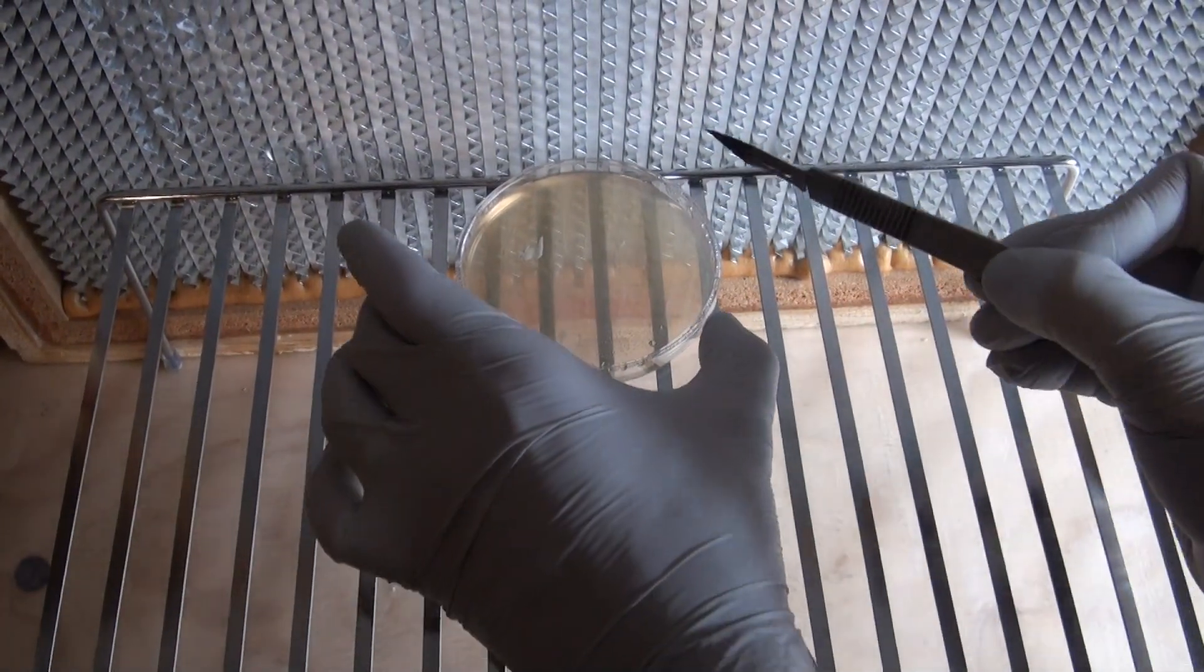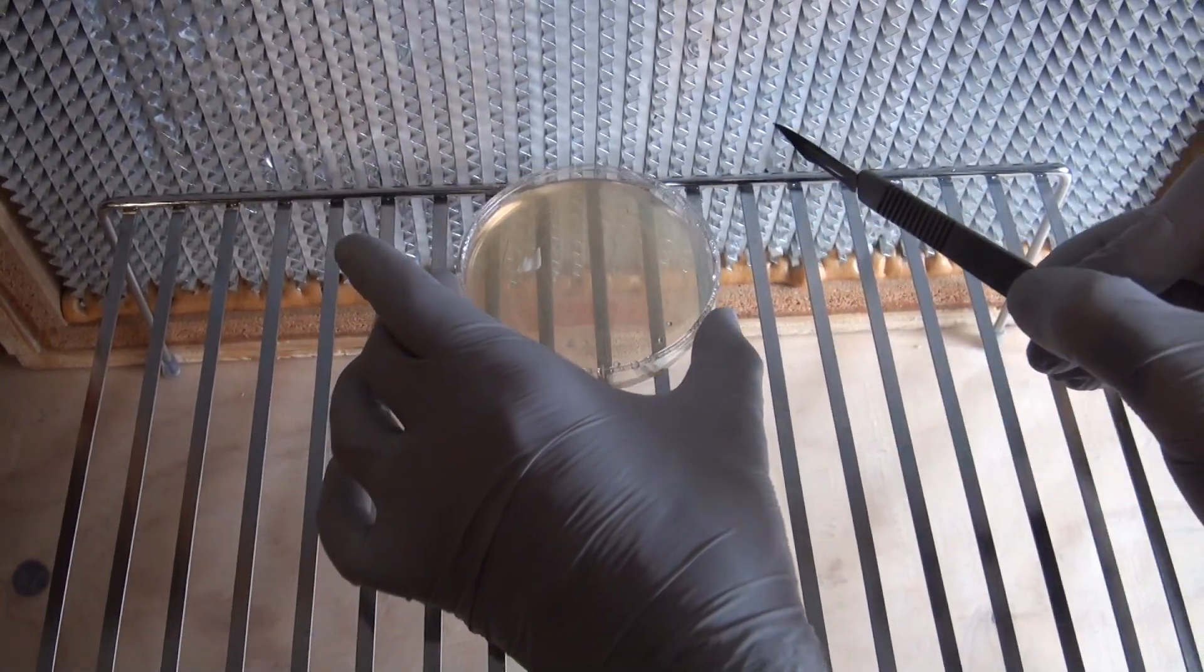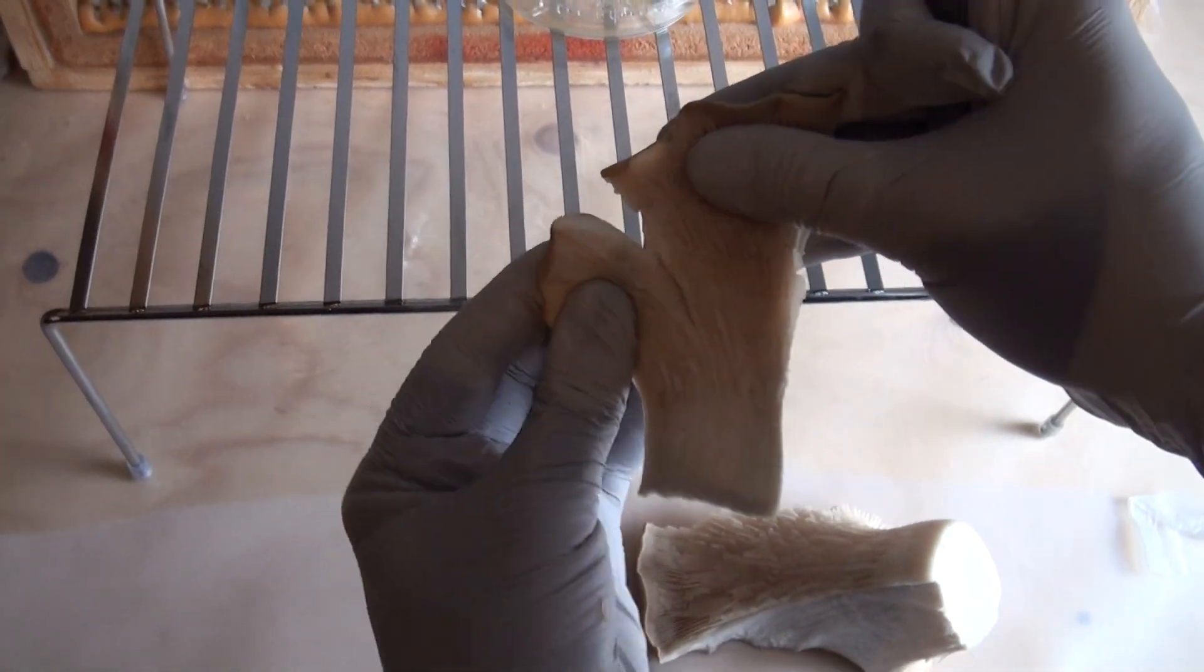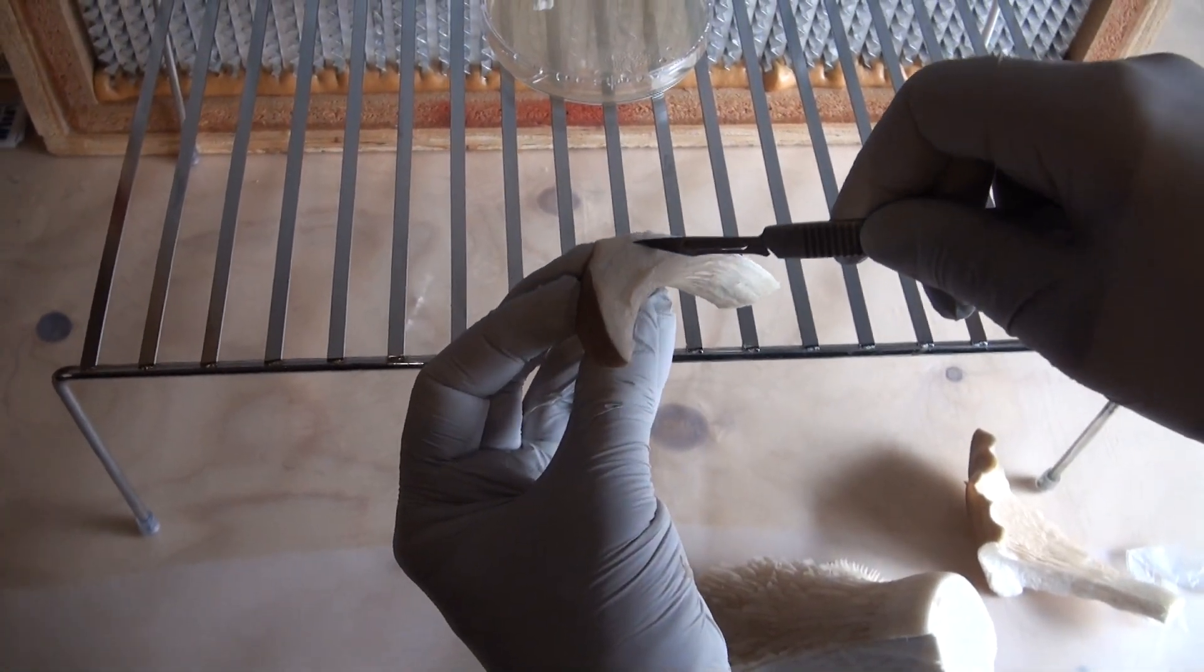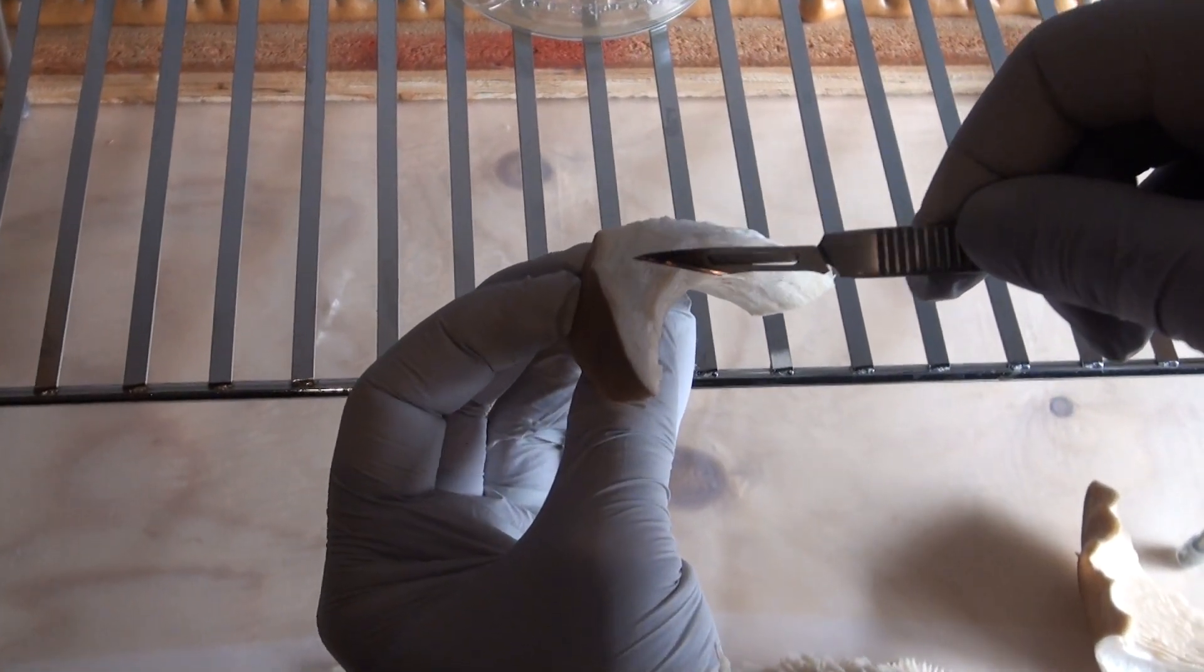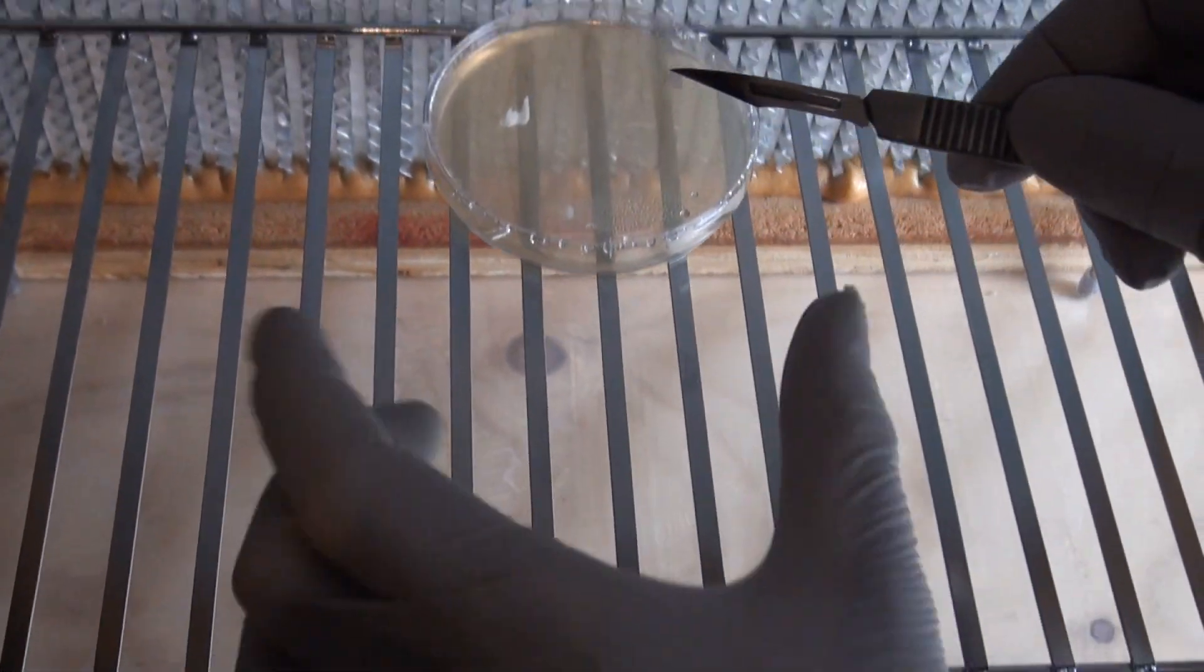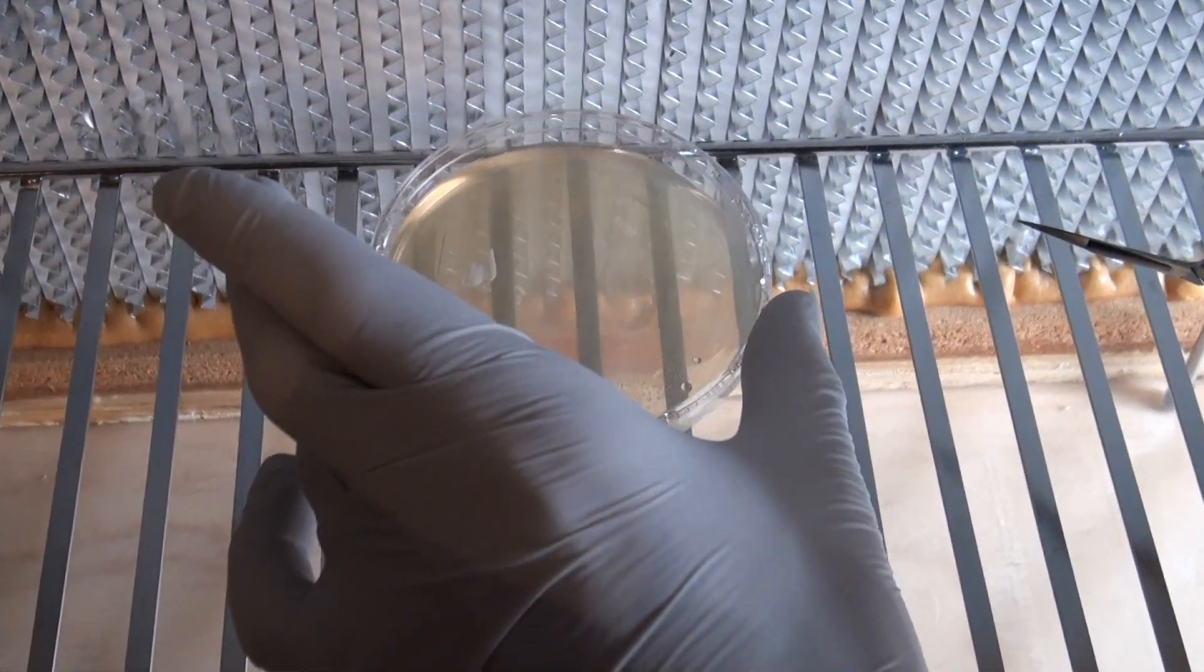Okay, so again I'm going to take the scalpel that's been flame sterilized, cool it in the dish, and take the mushroom fruit body, tear open a fresh piece, scrape some of the tissue out, and go ahead and place that down on the dish.